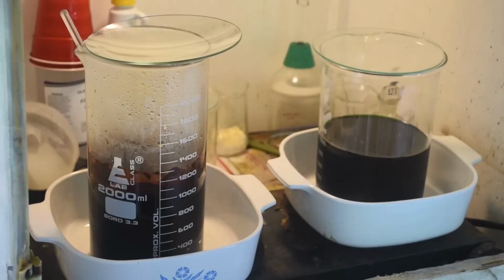So, all right, that worked so well the first time around. We're going to do it again. I've got another liter of my filtered liquid over here. And it's starting to warm up a little bit. I'm going to start putting some ammonium chloride in it. I know about the right amount now, about 3.5 scoops will dissolve in a warm liter of that liquid.